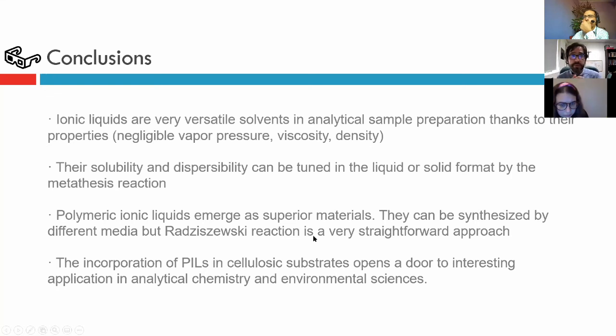Just as a brief conclusion, ionic liquids are very versatile solvents, you know that, but especially in the analytical sample preparation context, due to the different properties that we have discussed. We can, for example, modify the solubility and dispersibility of this type of materials playing with the counter ion. That's interesting. This is a suggestion, so you can use the Radziszewski reaction, which is very simple to synthesize polymeric ionic liquids with different functionalities. We are working on that currently.